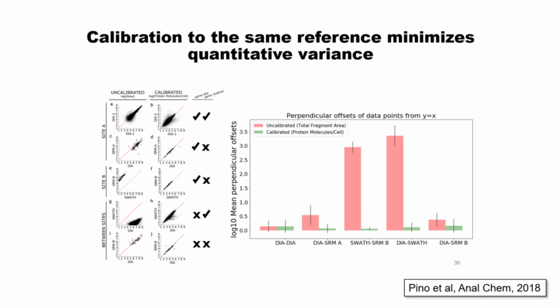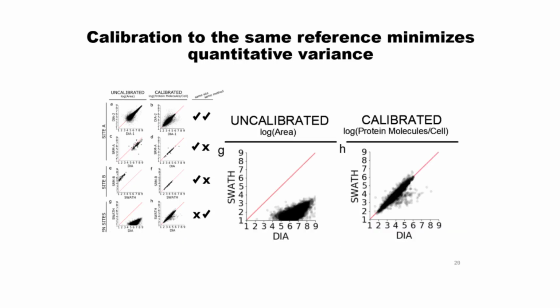Yeah. So I kind of missed it. So how exactly would you now calibrate according to the values reported in this paper? So yeah, you could use the BY4741 strain as one of your references too. That's basically what we've done between us and them. Or we will happily send you a culture of BY4741 that you would prep with each batch, and that you would measure relative to your samples.